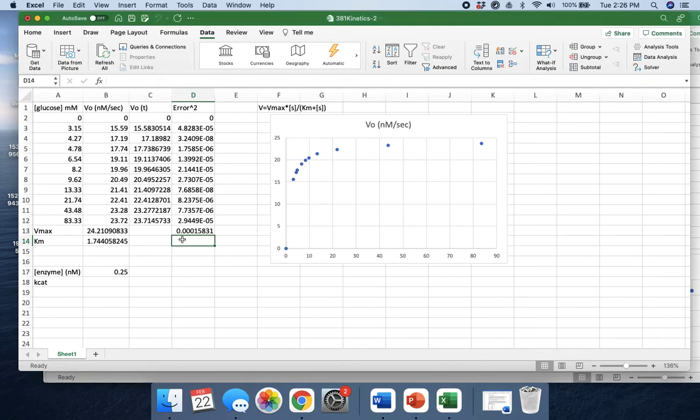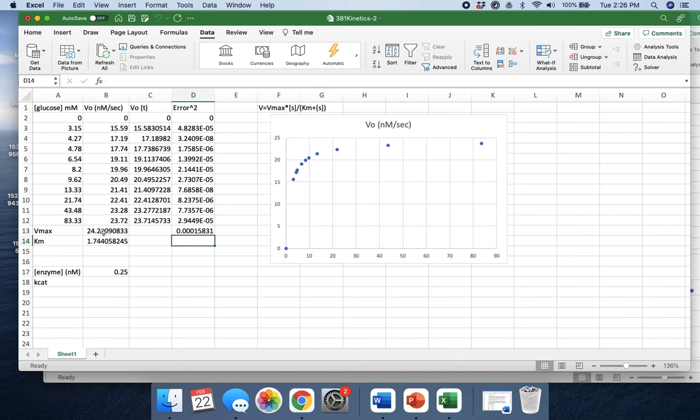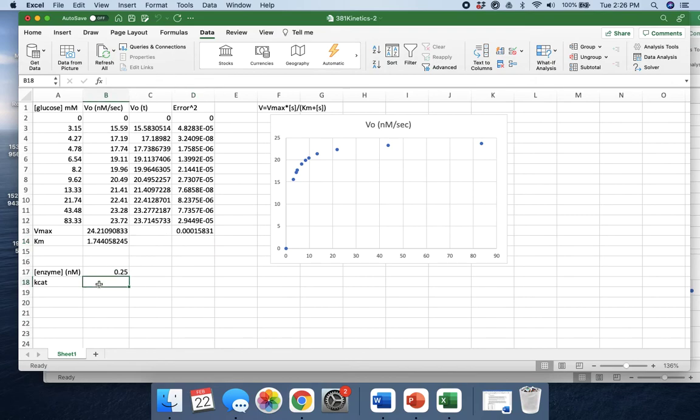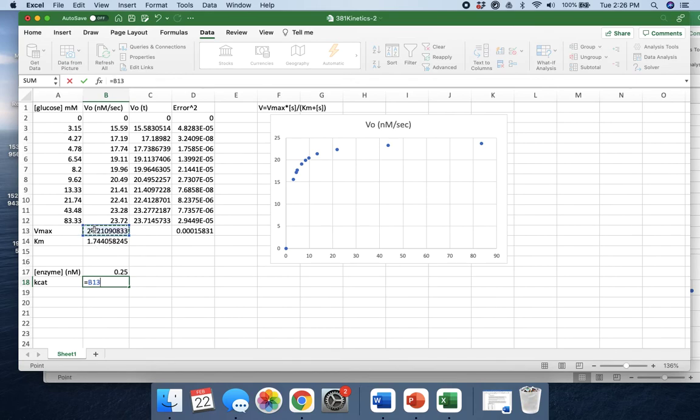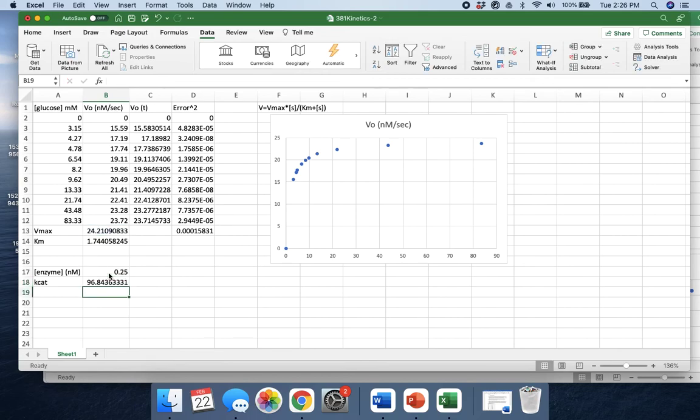It optimized these numbers to make our error as low as possible. So now we know with great certainty that our Vmax is 24.2 and our Km is 1.7. Pretty close to our estimations, but even closer. And now that you have that information combined with the concentration of your total enzyme, you can calculate what Kcat would be. We know that it's equal to Vmax divided by the concentration of the enzyme. And so there's our Kcat value. That's how you use solver.